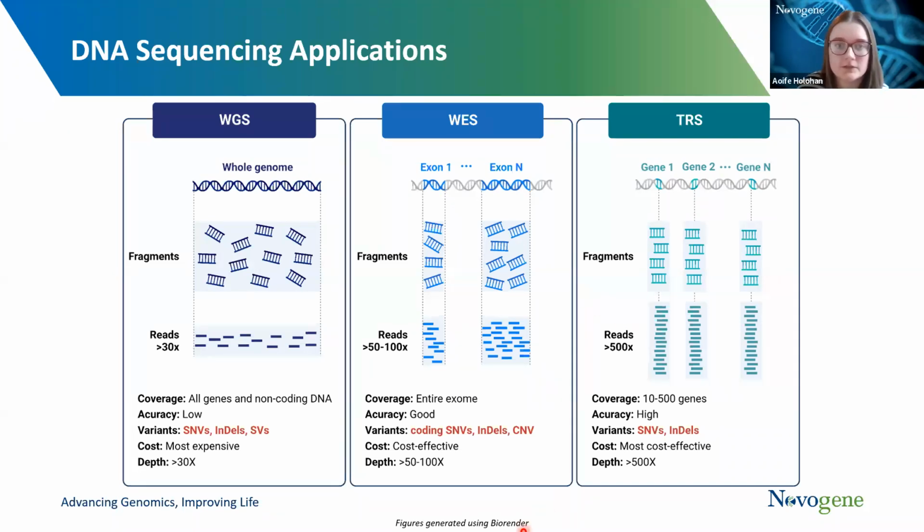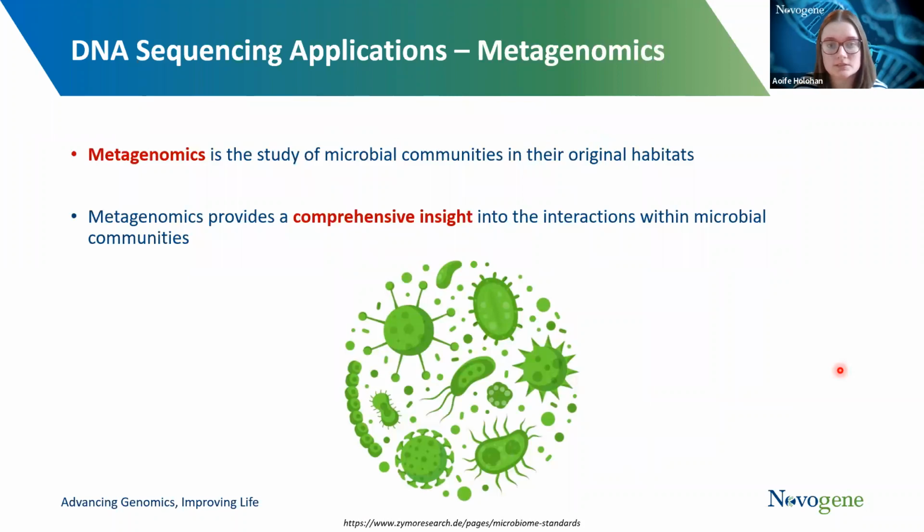Yeah, great. Okay, thank you. From Mustafa next, asking, how does the gene selection process work with amplicon metagenomic sequencing?